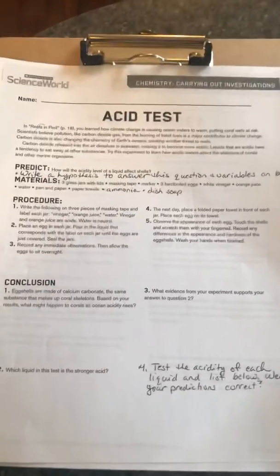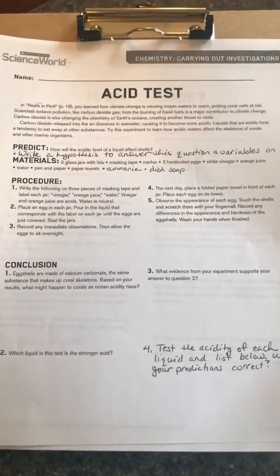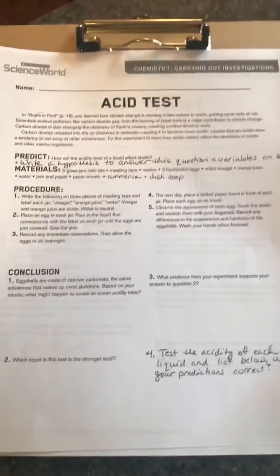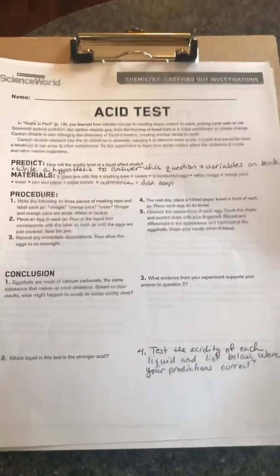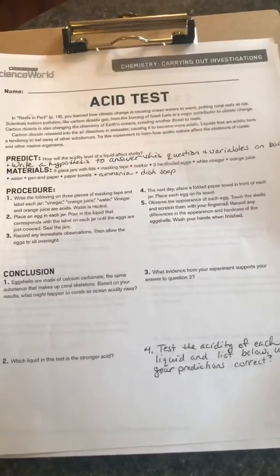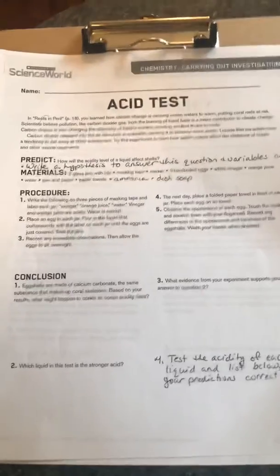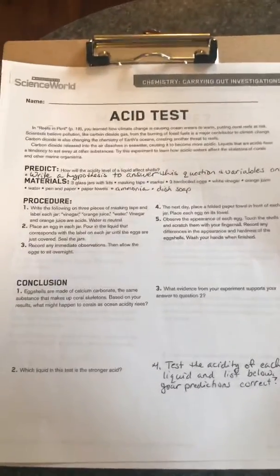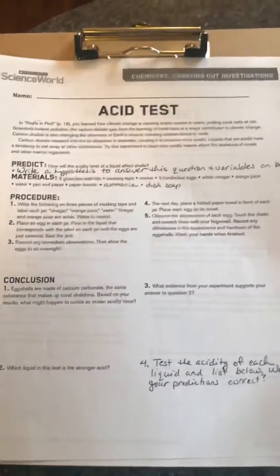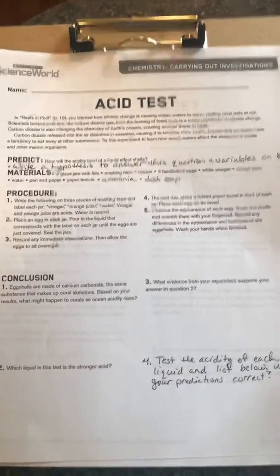Okay, we're going to work on the acid test lab right now. You'll notice it's referencing coral reefs and how climate change, when gases like carbon dioxide get into the water, might affect the coral reefs. And we know that carbon dioxide getting into the water makes the water more acidic. So what we want to do today is look at how those acids might react with something like a coral reef. We don't have a coral reef, so we're going to use eggshells to test that material, okay?